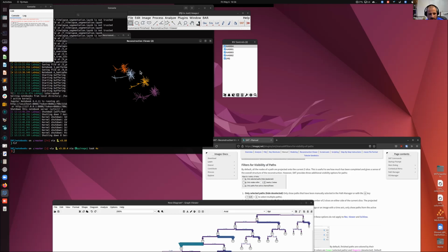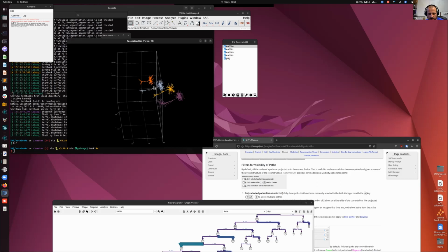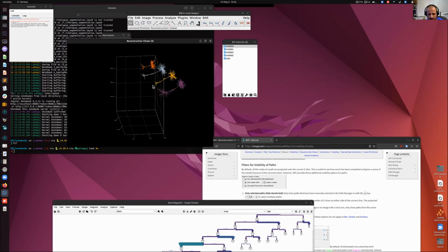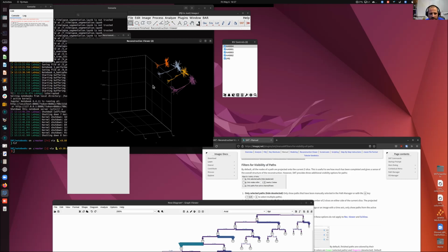You'll see in a second what I mean. I just wanted to give an overview of the capabilities of the viewer. The mantra is the same: you can toggle shortcuts without modifier keys. So I can press H for help, and you have a list of the shortcuts that are available. Or if you want that permanently, you can press F1.